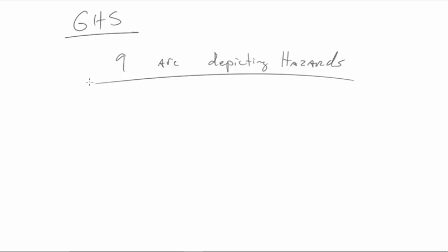But the GHS symbols and the NFPA symbols are all going to tell us some of the same information as far as how we want to proceed with this particular chemical. All right, so again, trying to keep you in the know, trying to keep you safe. We will definitely go over these GHS standard pictograms, and I'll have that and the NFPA posted in the room so that you can keep yourself safe.